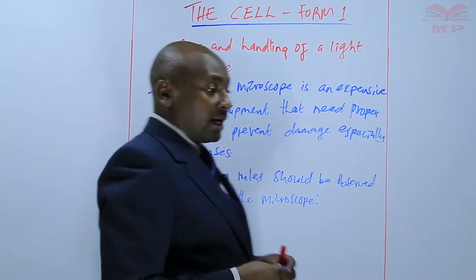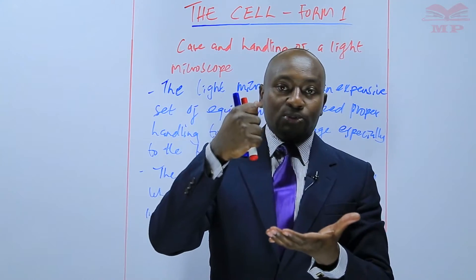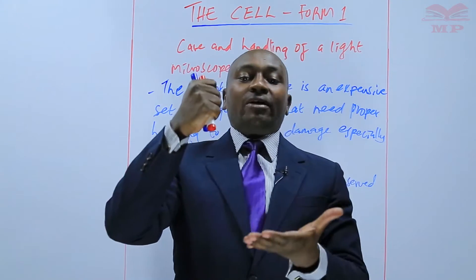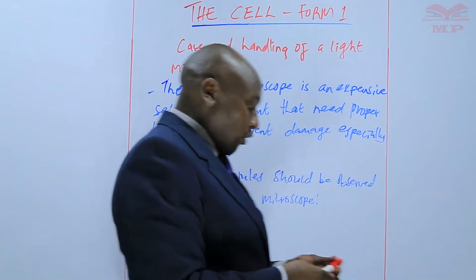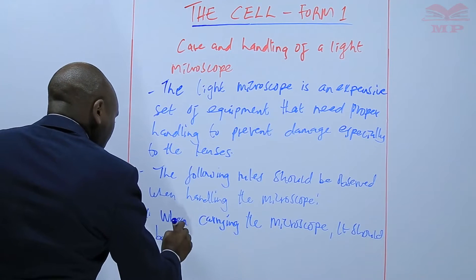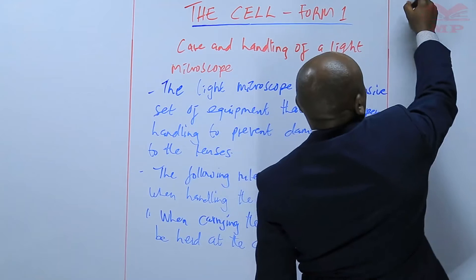Number one: when carrying the microscope, you should hold it by the arm and support it with the other hand at the base. Always make sure that you use both hands to carry the microscope from one point to the other, while one hand holds the arm and the other supports the base so that the microscope cannot easily fall.